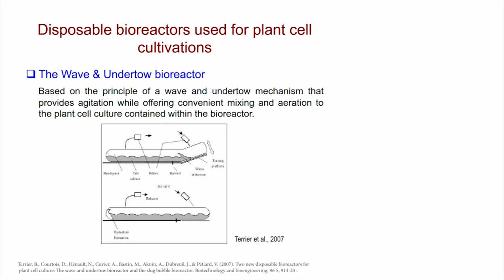Now, it is the same principle that works at the beach. When the wave comes to the beach, there is a large mass flux of the liquid towards the beach, but there is an equivalent mass flux against the beach which is beneath the trough. That is undertow, those currents which are backflow beneath your wave. So, they work in opposite directions. This is what will cause mixing to happen when this wave gets created. That is what is called the wave and undertow mechanism.